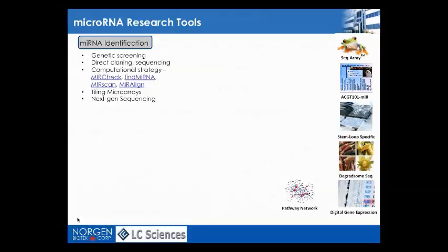So once you have your microRNA isolated, and typically the yields are pretty low from this type of samples, typically, no matter what type of follow-up experiment you're doing with the actual sample, you will have to amplify your microRNA. So I will go into the different types of experiments that you can do with your microRNA samples, and focus there specifically on, of course, arrays and next-gen sequencing, and then highlight a couple of customer publications.